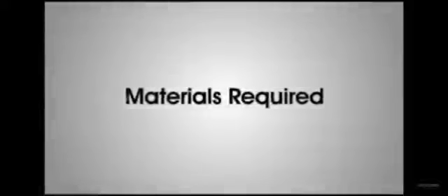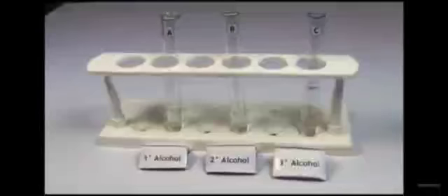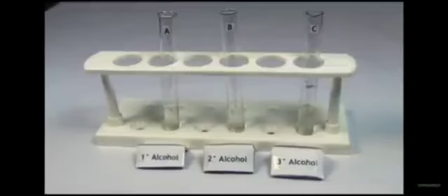Last test is the Lucas test, which distinguishes between primary, secondary, and tertiary alcohols. Materials required: Lucas reagent, heat, dropper, and water bath. The alcohol is treated with the Lucas reagent, which is the equimolar mixture of HCl and zinc chloride.